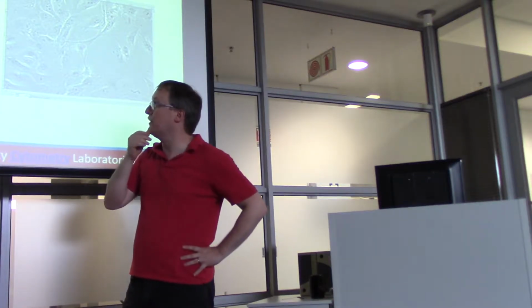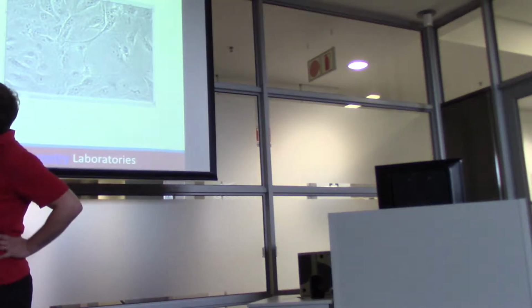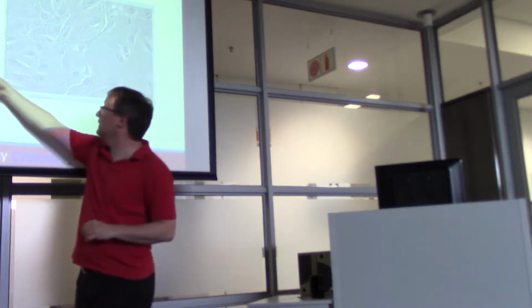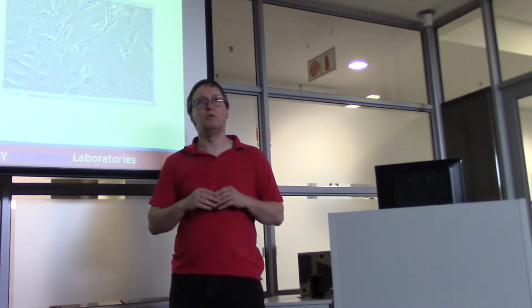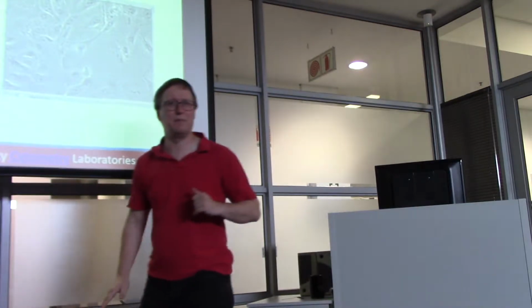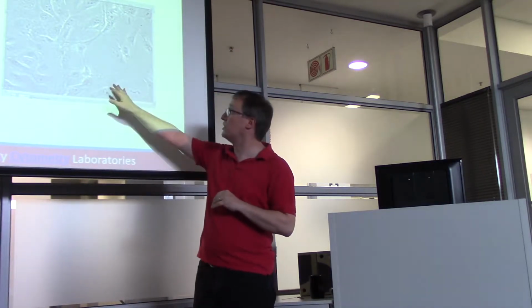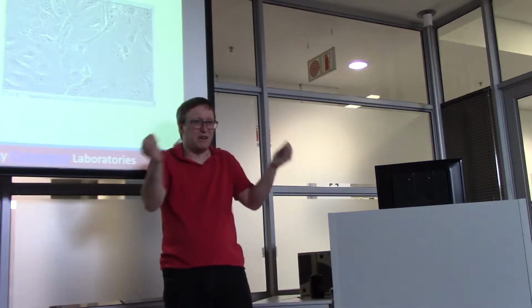Now, have we used the very darkest colors in this image? Not really. So black is all the way down here, and we see that there's really no appreciable number of pixels with total black to be seen here. We did, however, use some values all the way up here at the white end. One way that you could read this is that you've overexposed it, but that's not really the case because we don't have, say, this edge butting up against the top. But we certainly haven't used the very bottom of our intensity range. So if we're trying to interpret these data, these cell images, we're going to run into this problem that pretty much everything is kind of muddy right there in the middle.